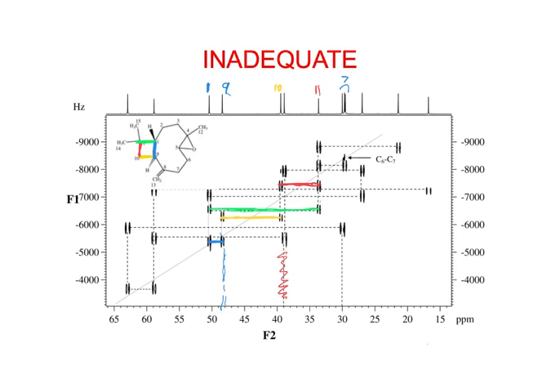The other ones must go to the methyls. So one of these has to be a methyl. So we have 14. It's got to be one of the ones in here too, I think, the way I had it. And the other one is like, I don't know which one is which, but like 15.